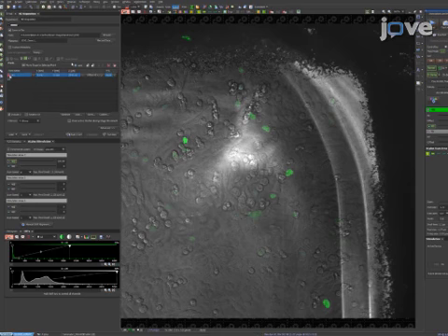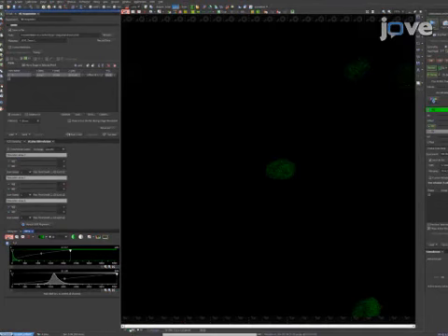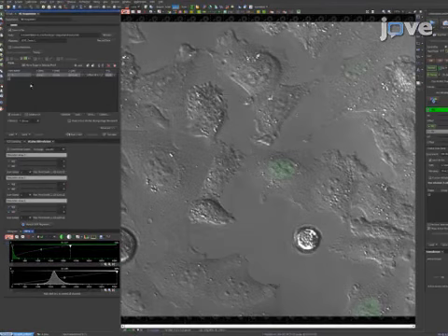Once image registration is complete, select a field for micro-irradiation and focus the sample. For cells expressing fluorescently labeled proteins, select the focal plane with the maximal nuclear cross-section in the fluorescent channel of interest. Focusing on the maximal cross-section of the nucleus is crucial because it ensures that the focal plane is centered on the nucleus for monitoring recruitment of the protein of interest to the site of induced damage.